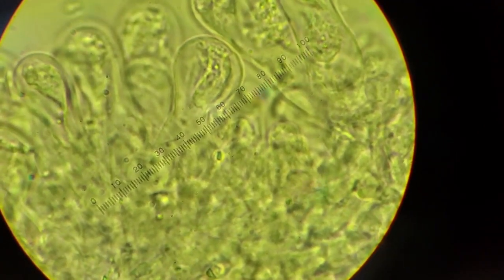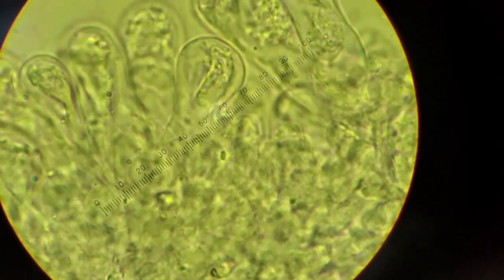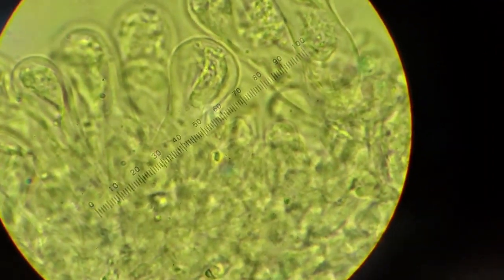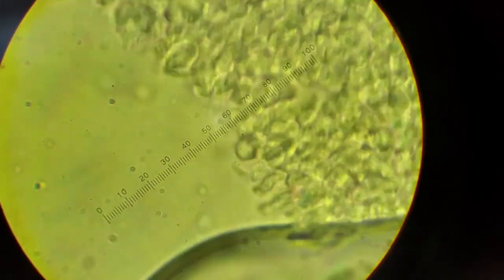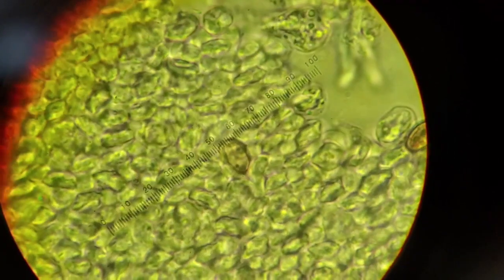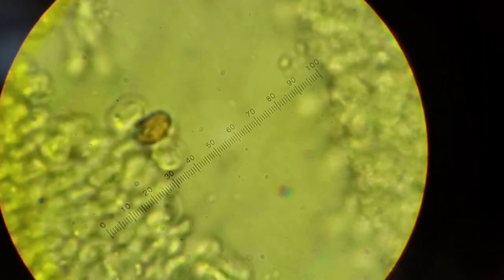Now, as far as looking at the trama and such, it's probably best not to do a squash mount because it completely obliterates any organization that the cells and the hyphae have. So this is best just for looking at these edge cells, and it's also useful for looking at spores. Now, spore measurements, this is not a mature specimen because there's really not that many spores to look at. Usually there's so many you don't know what to do with yourself.